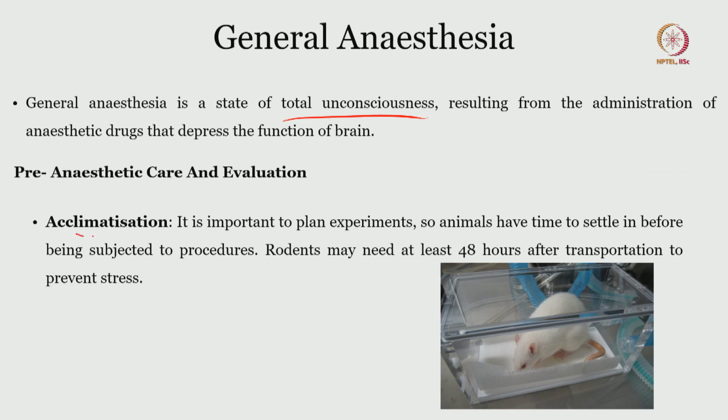So acclimatization is very important. You plan your experiments and animals have time to settle before you actually submit. So at least 48 hours is what is required after transportation to prevent the stress related hormones affecting the performance of your various anesthetic drug that you are going to give.